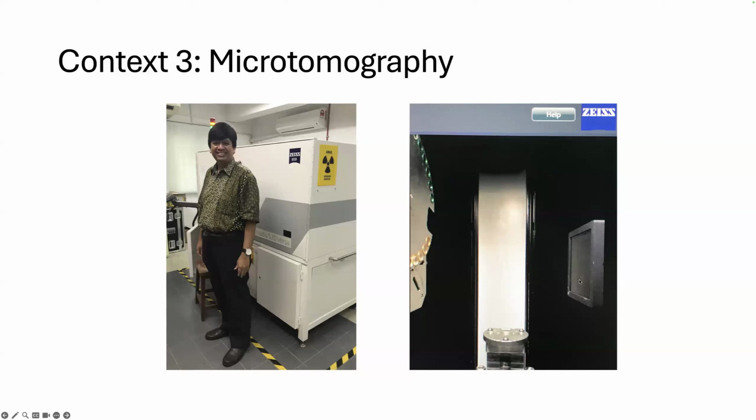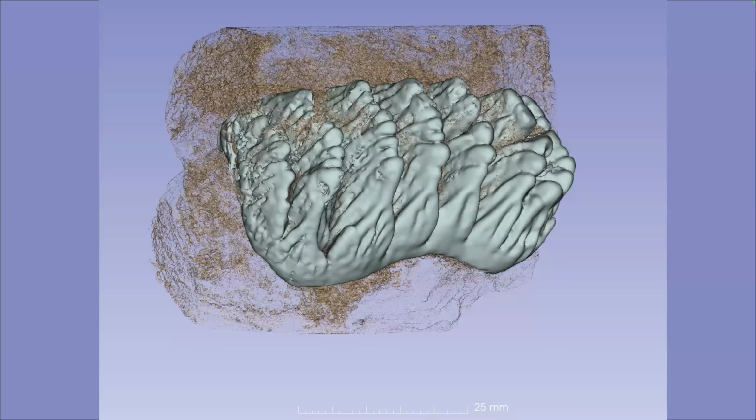what's recorded is where there are more dense things in the objects that you're rotating there. And the denser things cause a larger attenuation. What the software does is reconcile all that information taken from the full 360 range of orientations, and it compiles it into a stack of slices, often around 1/100th of a millimeter, sometimes less, sometimes more. I'll mention the resolutions each time we come to a specimen.